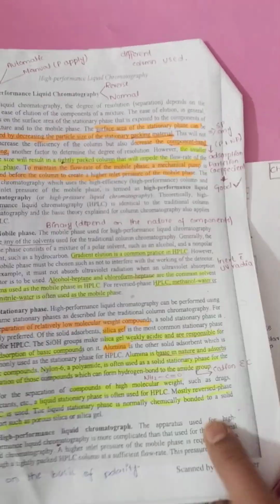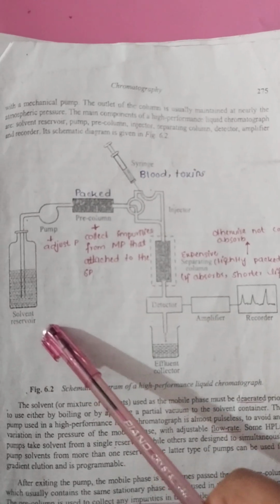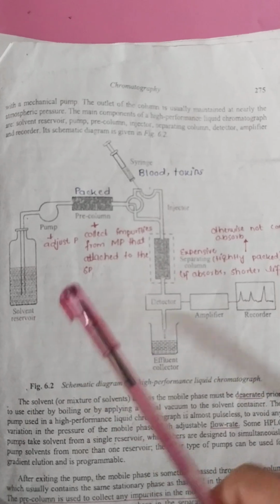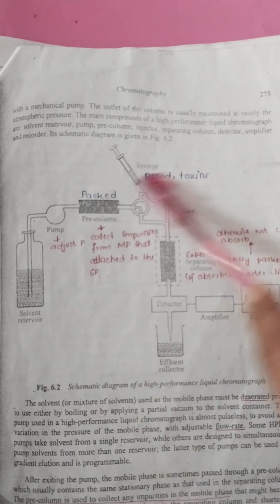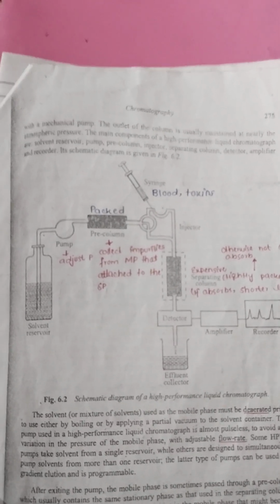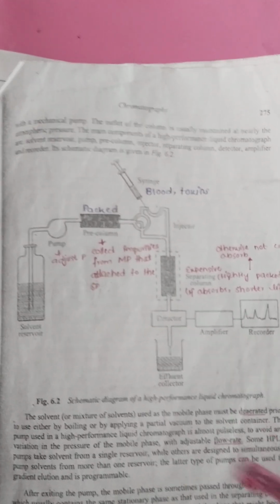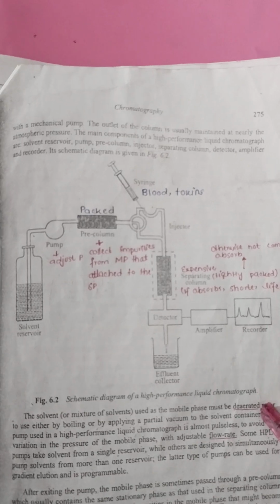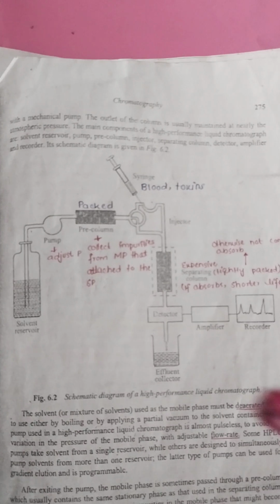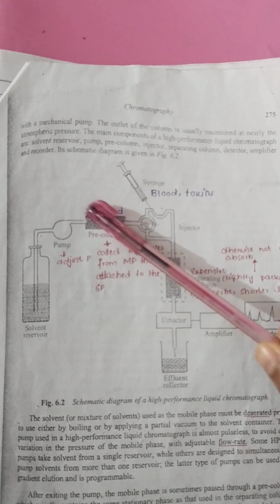If we talk about HPLC, we represent it diagrammatically. Now this is a solvent reservoir. What is a solvent reservoir? It is the mobile phase that flows through the column, over the stationary phase, and separates our components. We select a mobile phase that is deaerated by two methods, by boiling or by vacuum. Then this deaerated solvent passes through the pump.